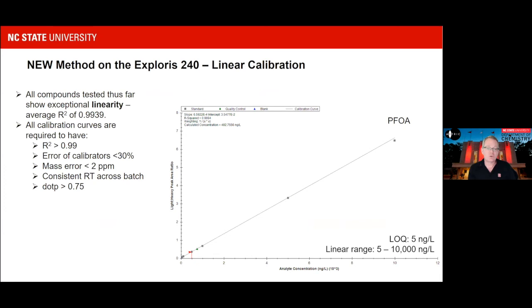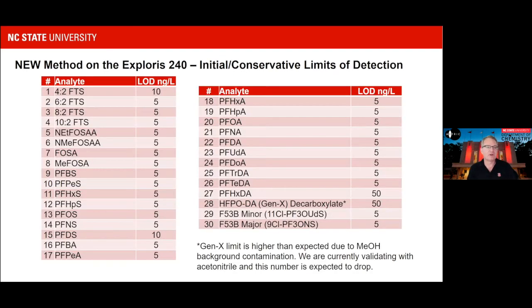In the PFAS world, most of their limits are expressed as 5 nanograms per milliliter, but our detection limits are so much more superior than what's in the literature that we've just moved it to nanograms per liter. Just because if you're reading the literature in this area, you see 10, you're going to think it's exactly the same as what's been done before, but it's actually orders of magnitude better. And so these are our initial conservative limits of detection using these methods, and they're all looking really good.